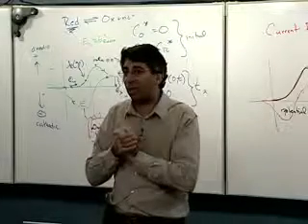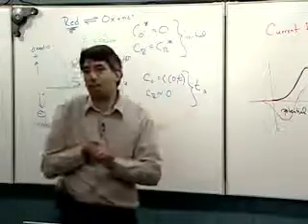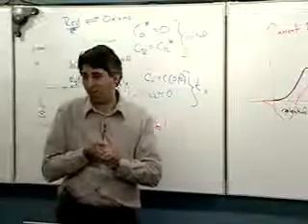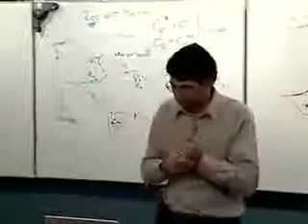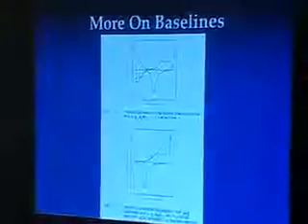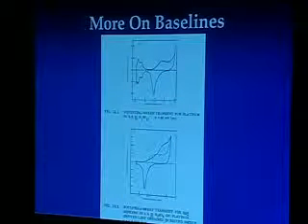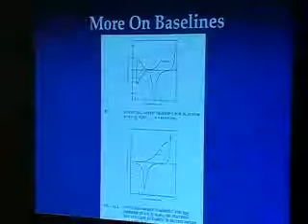So a nonlinearity in the peak current versus concentration plot is a great diagnostic for chemisorption on the surface. And that's worth checking if something funny is happening. This is platinum again. Obviously, if I use a different material, gold, carbon, whatever, I don't expect to see this particular shape. The platinum shape is one of the cleanest, easiest ones to see, though.